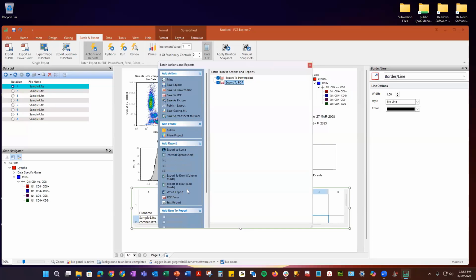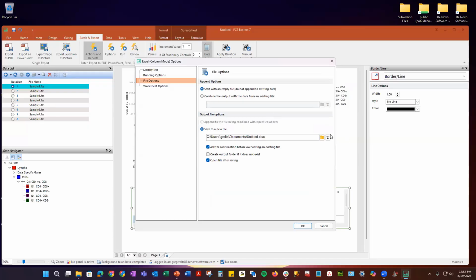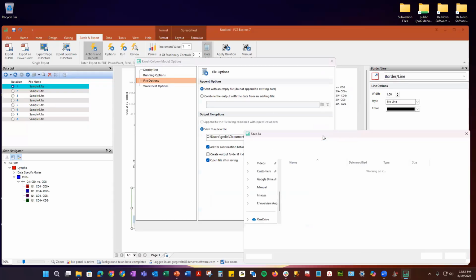And then last thing we're going to do is Excel. So I'm going to do Excel here. I'm going to say where I'm going to save it first.